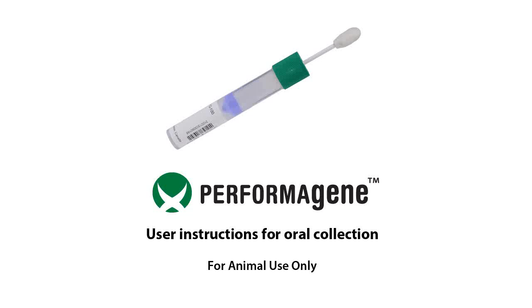PerformaGene is easy to use, non-invasive, and reliable for animal DNA, making it ideal for the safe collection, stabilization, and transportation of DNA samples. For best results, animals should not eat or drink 30 minutes before sample collection.